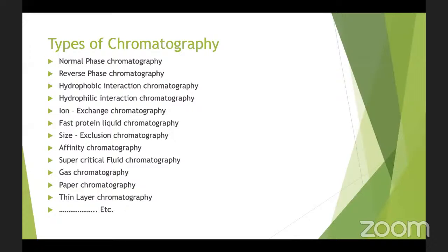Then reverse phase is basically the reverse of normal phase. Here the stationary phase is non-polar while the mobile phase is polar.